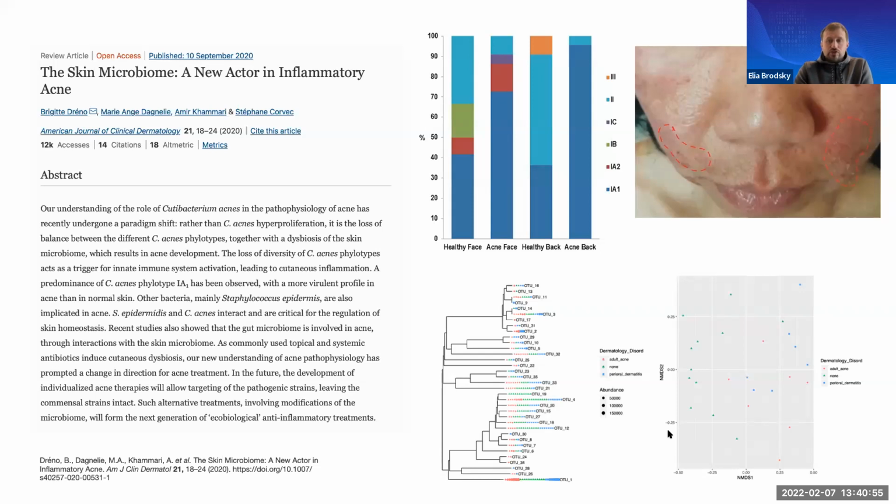So one of the questions could be, how do these microbes essentially interact with the skin itself in inflammatory acne, right? So how do they cause inflammation? And so here in this discussion, we can also download the data, and we'll look today at where this data could be found and try to understand what are some of the differences.